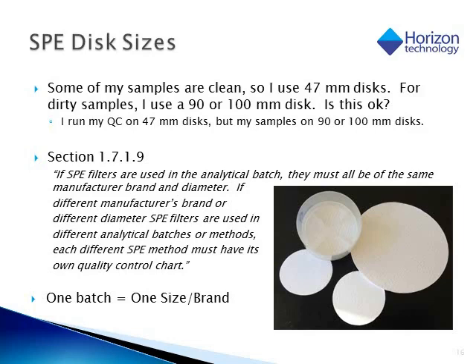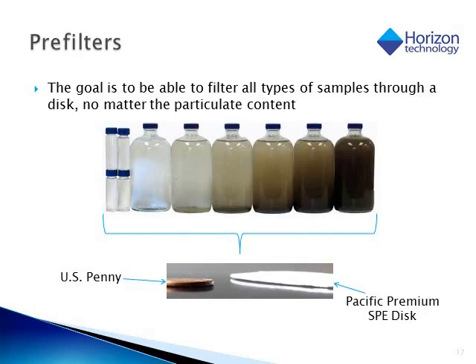You should also be aware that each brand and size disc that you use must have its own control charts. But what about pre-filters? Do we treat them the same as discs? The goal here is to filter all types of aqueous samples through a disc that is about the same thickness as a penny. If we use only an SPE disc, odds are good that we'll have some sort of trouble.